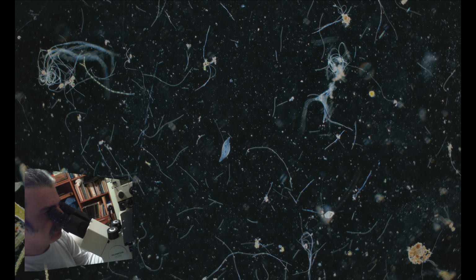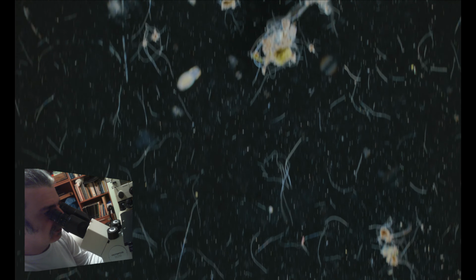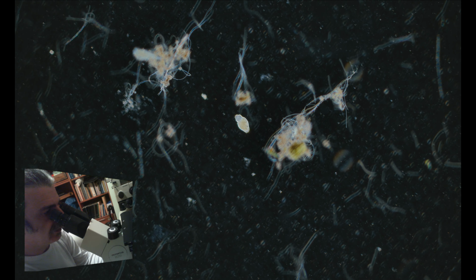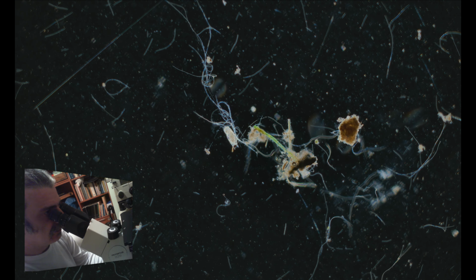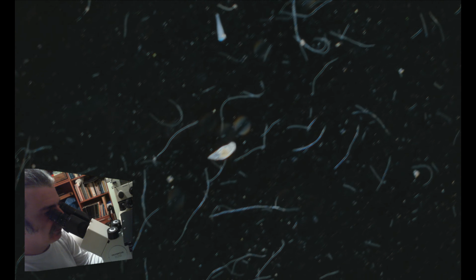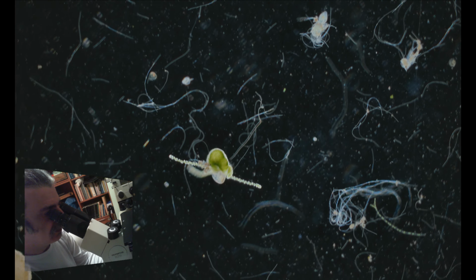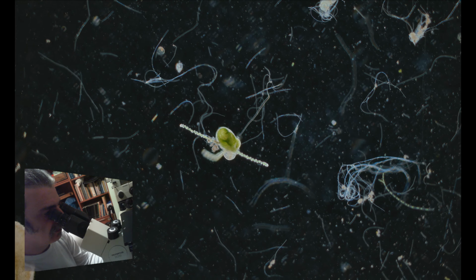Lytonotus, both are ciliates. A rotifer. This one moves like a worm, we'll see it later. Here is another rotifer in the middle. Another rotifer that travels. A stentor. Hydra. Looks like it's in the middle of catching prey.